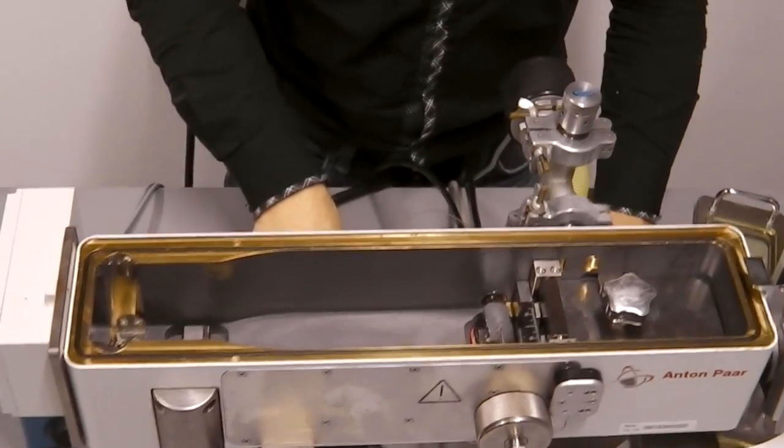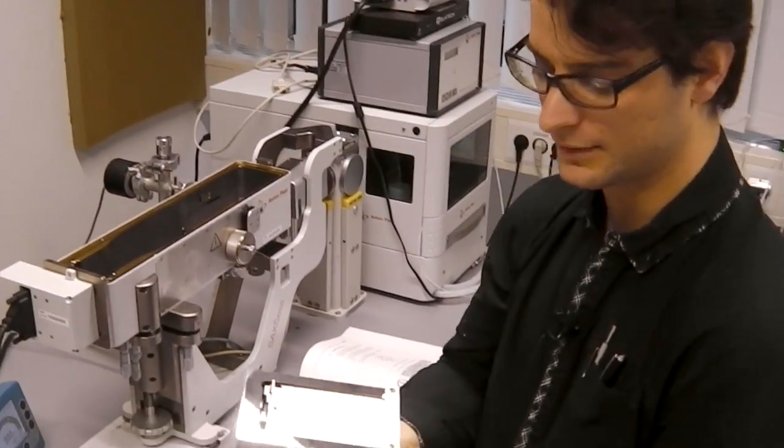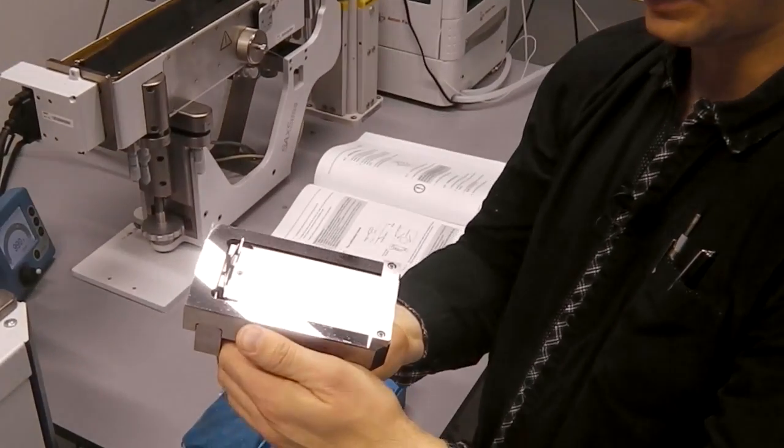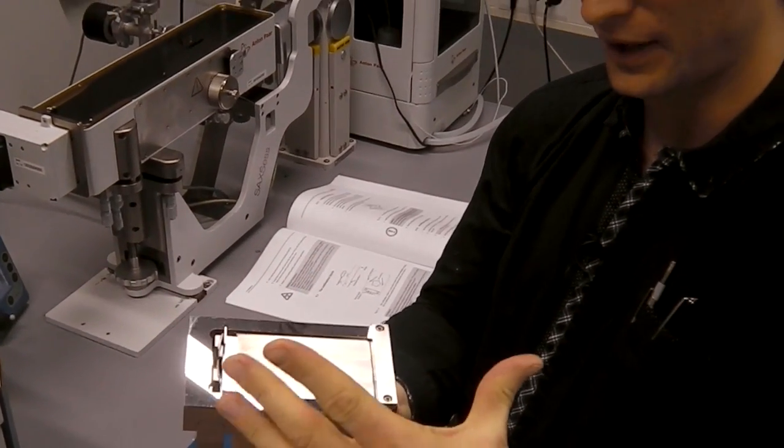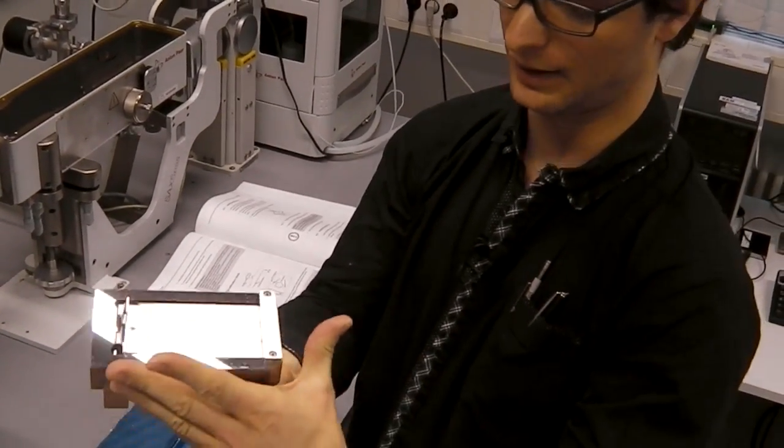The whole length of this instrument is maybe 30 or 40 centimeters. On the bottom of the collimation block we have the active part.